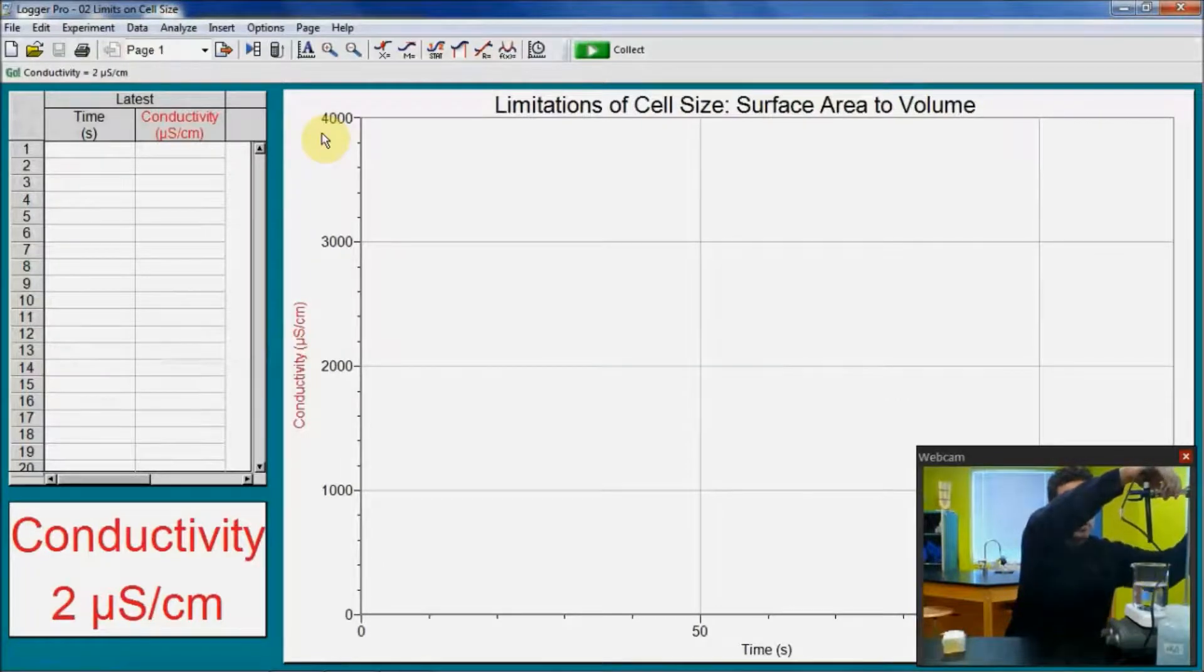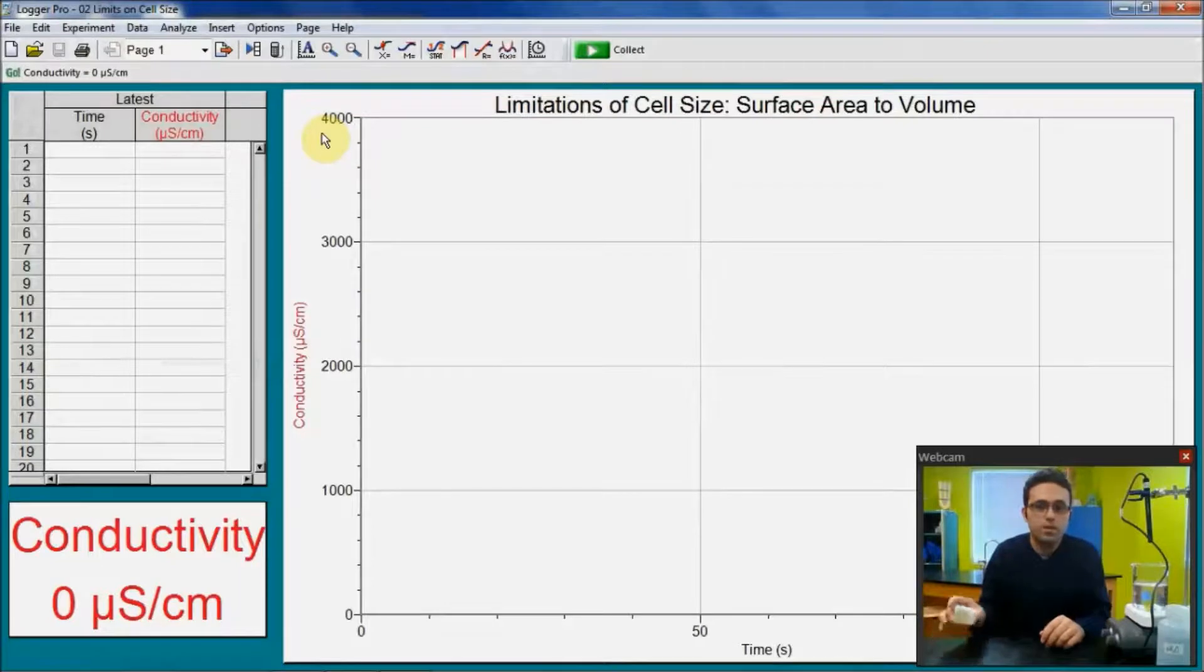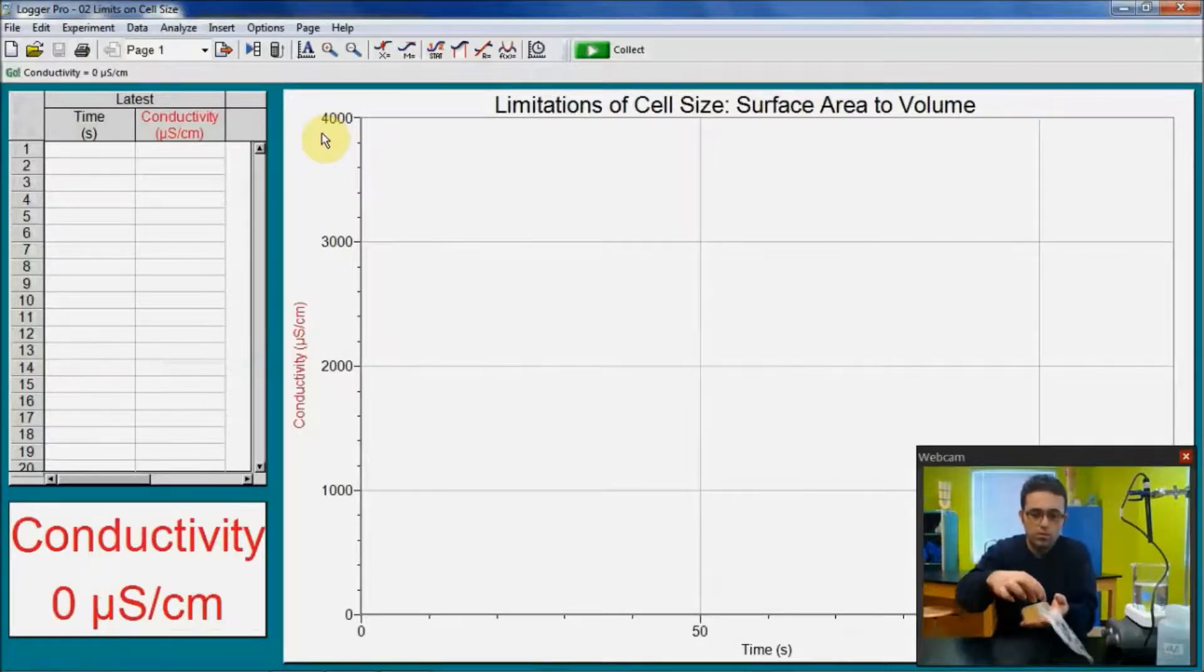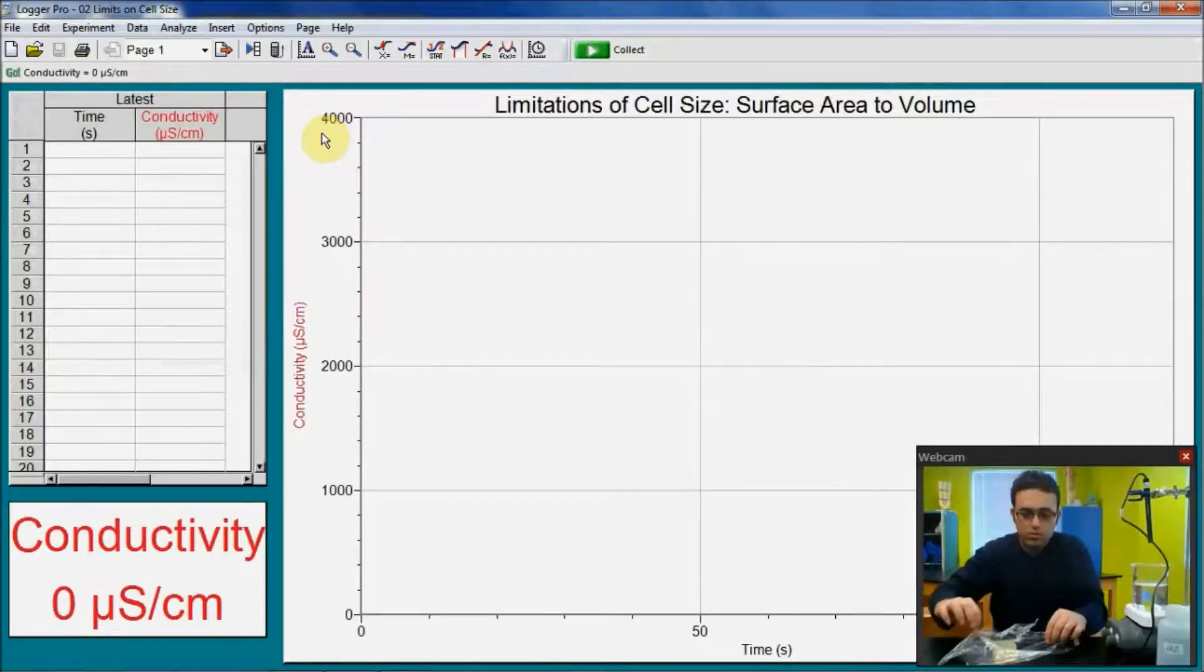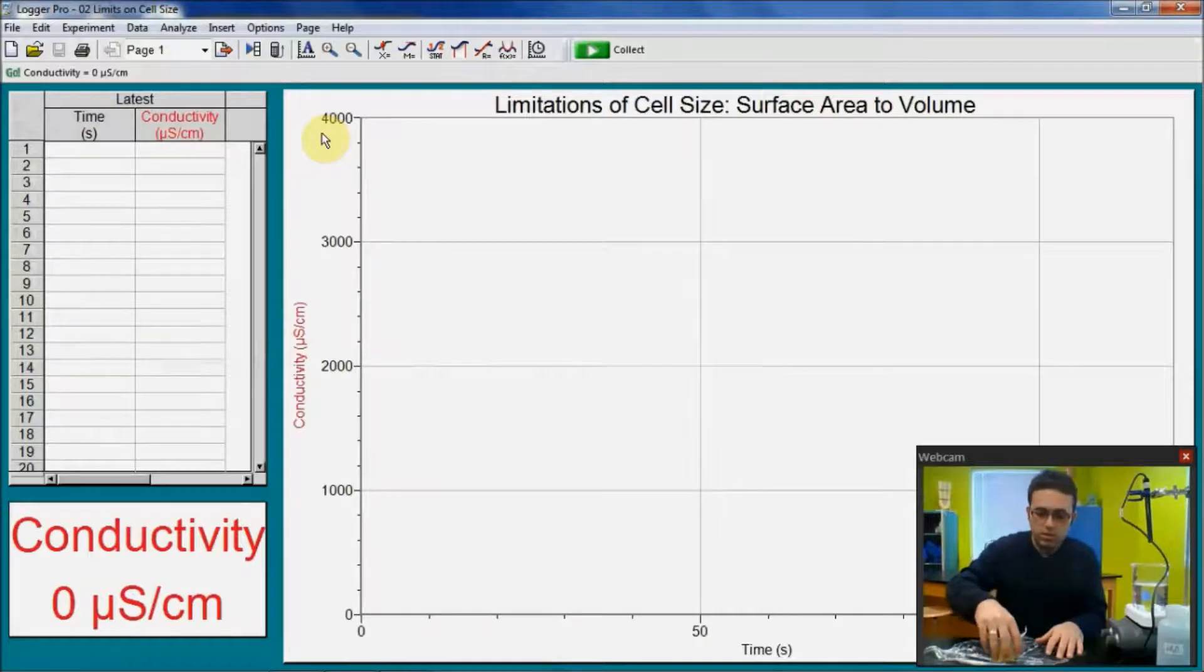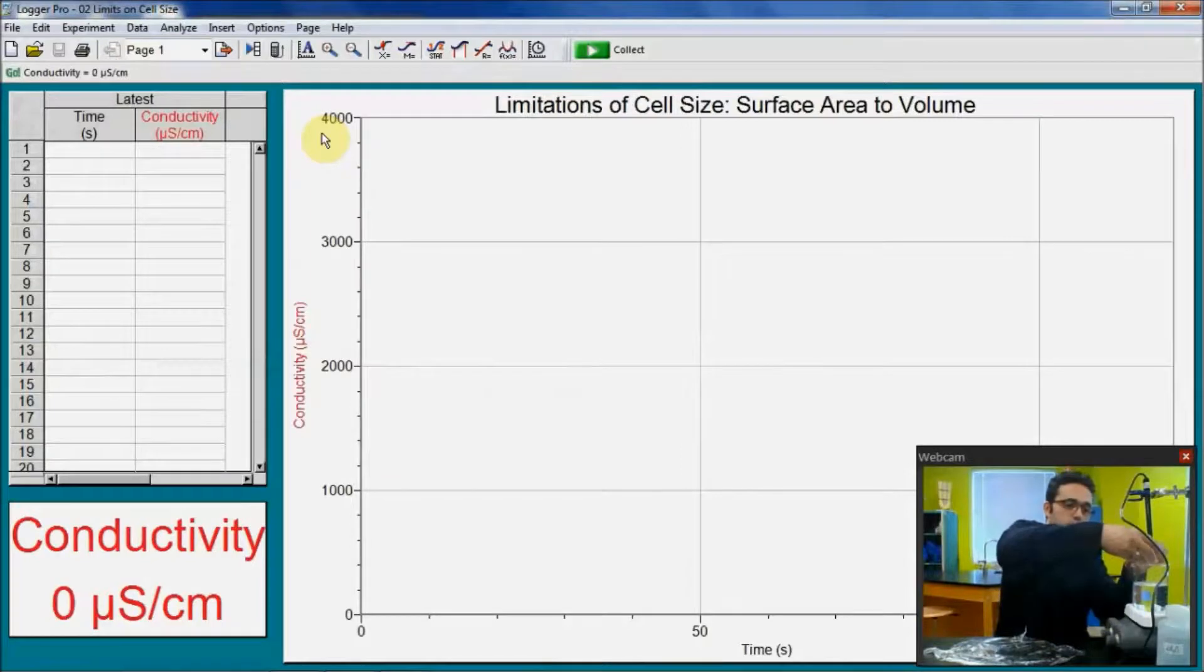Now, before I start my experiment, I will place my model cell, which is this agar cube, into the distilled water. I wrapped it in these plastic wraps so it won't lose water through evaporation and won't change its concentration. I prepared them beforehand and I store them in these plastic wraps until we start the experiment. In another video, I will try to show you how you could prepare these agar cubes. So I will place this in the water, distilled water, and then I submerge my conductivity probe into the distilled water and then start data collection.